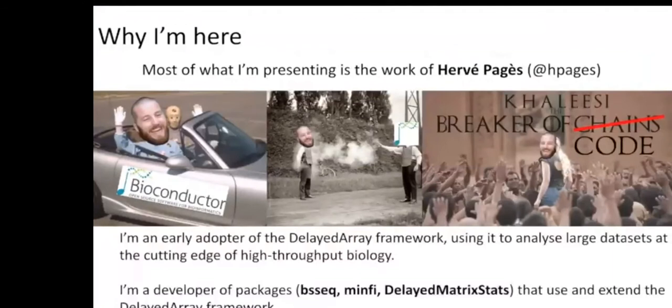The DelayedArray framework is led by Hervé Pages, one of the Bioconductor core team members. The reason I'm here today presenting this workshop is that I have been an early adopter of the DelayedArray framework, using it to analyse large datasets at the cutting edge of high-throughput biology. So I see myself as a bit of a crash test dummy for the DelayedArray package. I'm also a developer of packages that use and extend the DelayedArray framework, in particular those for analysing DNA methylation data.